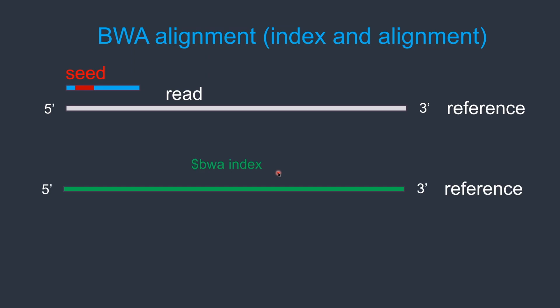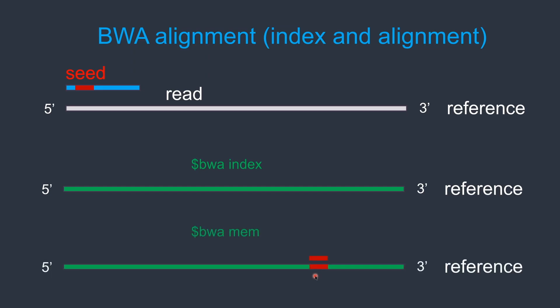FM index is a compressed suffix array used for efficient substring searches within the reference sequence. It allows BWA to quickly locate matches for parts of the reads in the reference genome. After indexing, we can align the reads using BWA MEM. The BWA MEM command performs seed-based alignment, where parts of the read are called seeds.